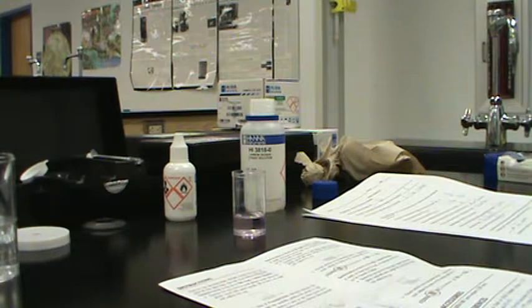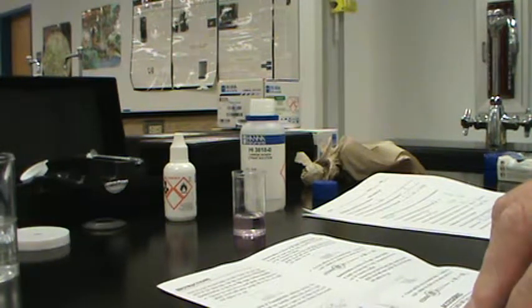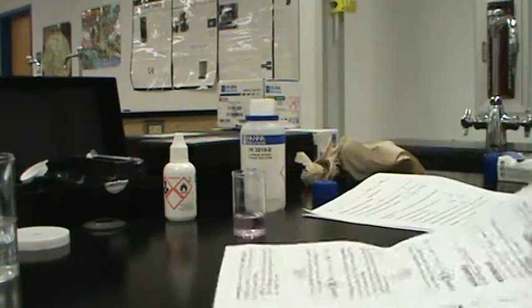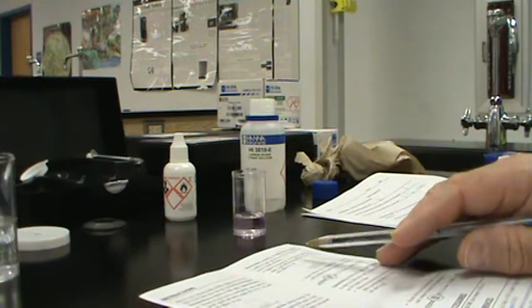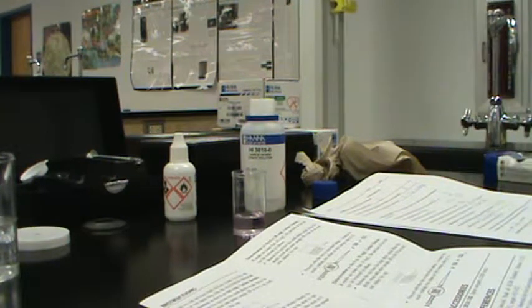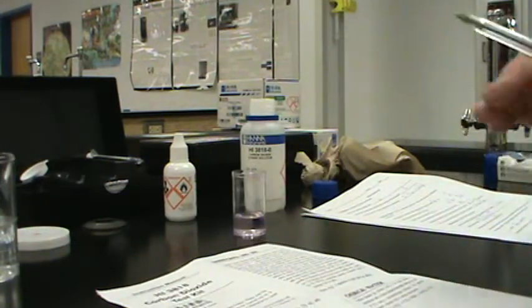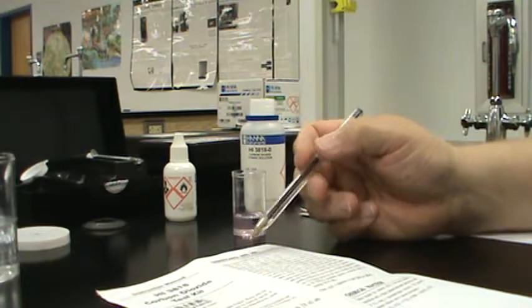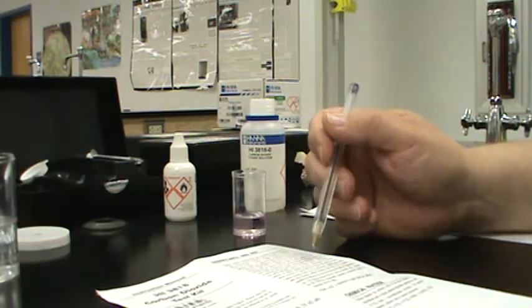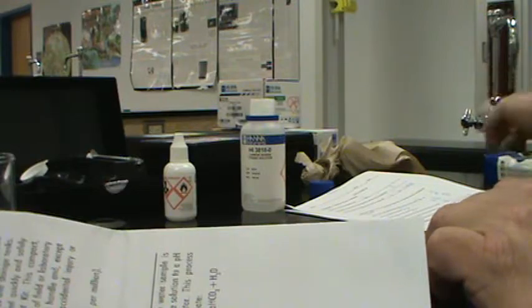So if we're in the zero to one hundred range, we are on the small end at 36 mg/L. If the results are less than fifty milligrams, we can actually improve precision by doing this again with a larger sample. But we're good. We are positively fine with this, so we are just going to leave this as it is. Generally, lakes contain less than ten milligrams, and ours has thirty-six, so we were a little bit higher in carbon dioxide.